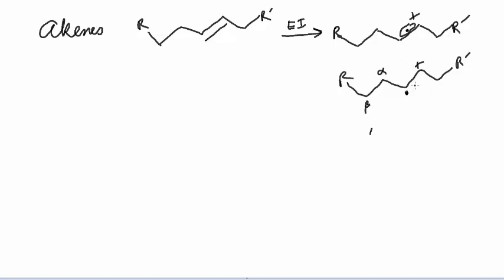We're going to see a homolytic type of cleavage. The cleavage is between the alpha-beta bond, homolytically breaking. One electron like that, the other electron over to this bond. This odd electron comes over to meet that electron. And that's going to produce this neutral radical.